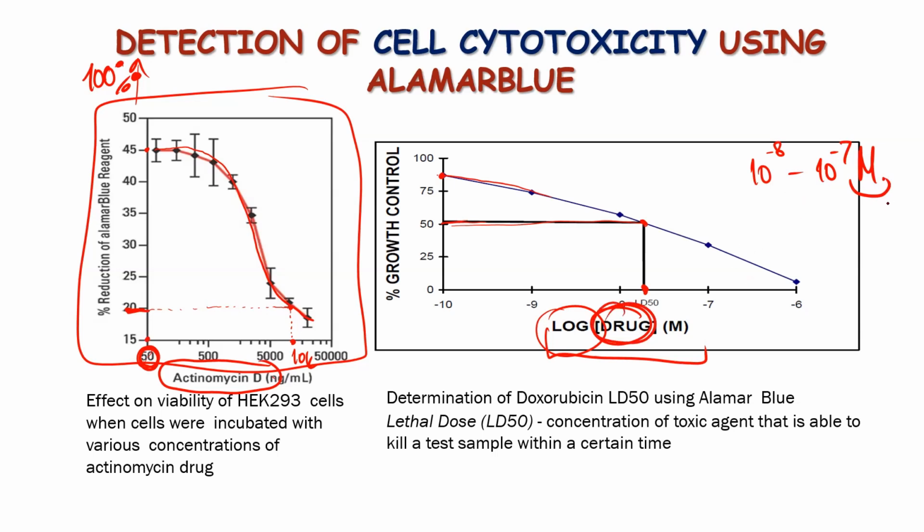It means that with the increase of this molarity, we will see more and more cells dying. And of course, this drug cannot be used at these concentrations. I think the best, again, would be going as low as 0 concentration to understand how the drug behaves.